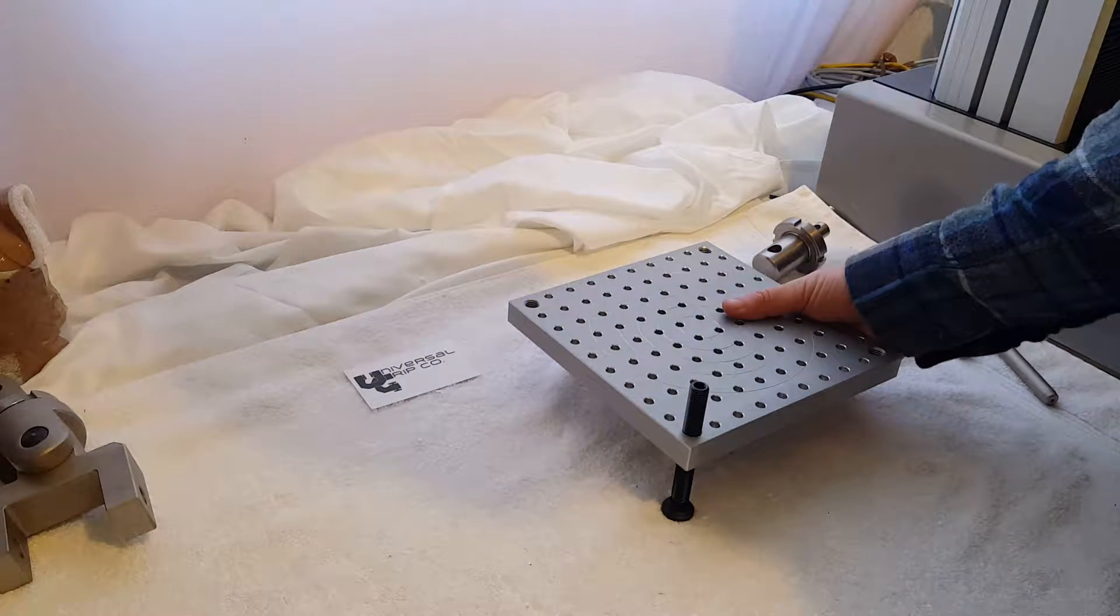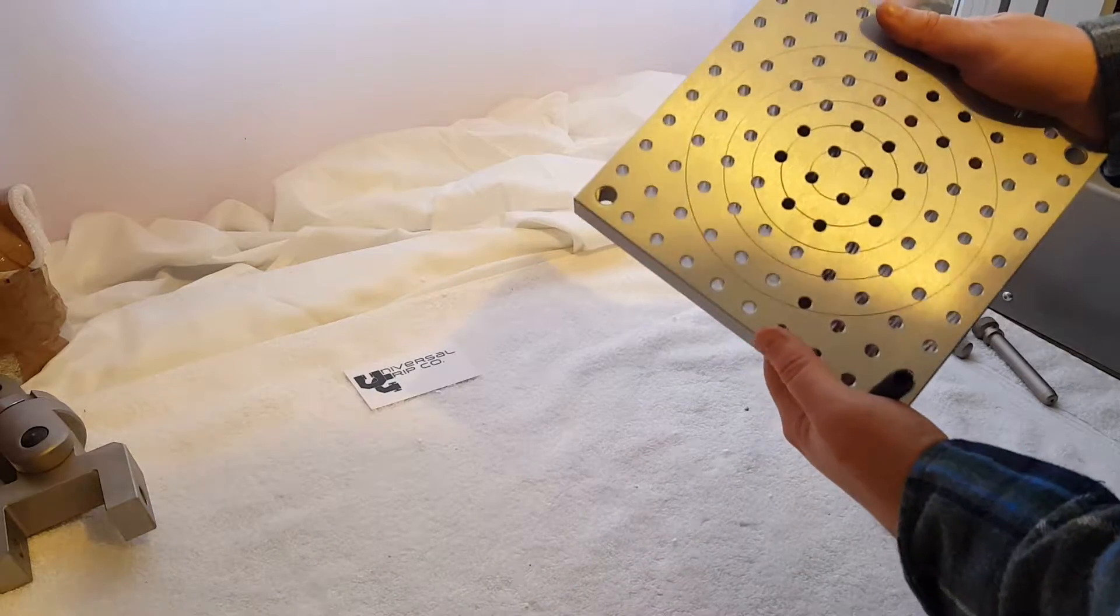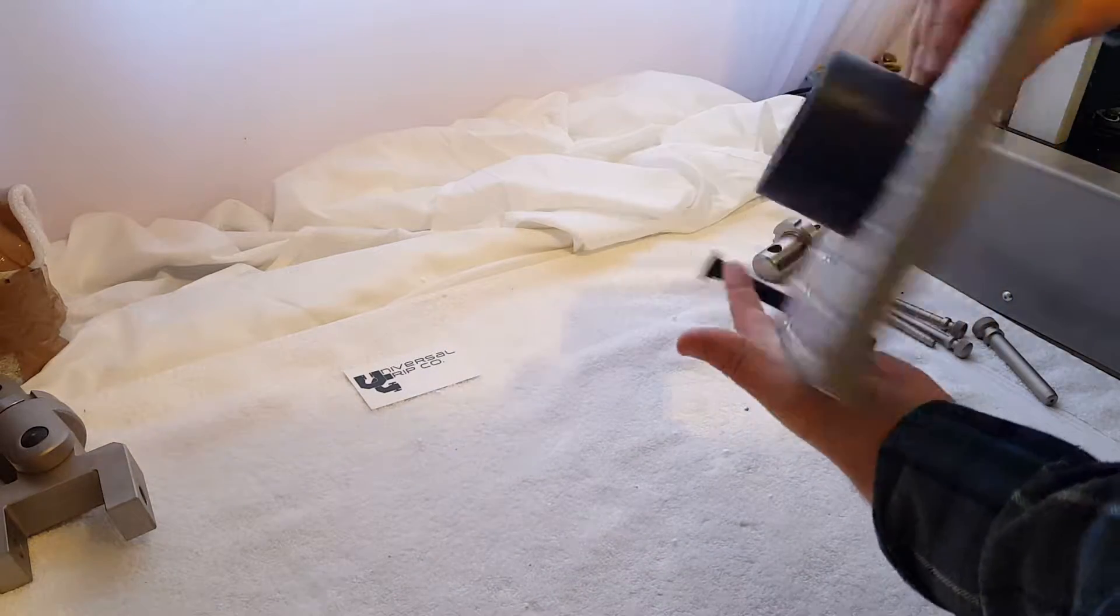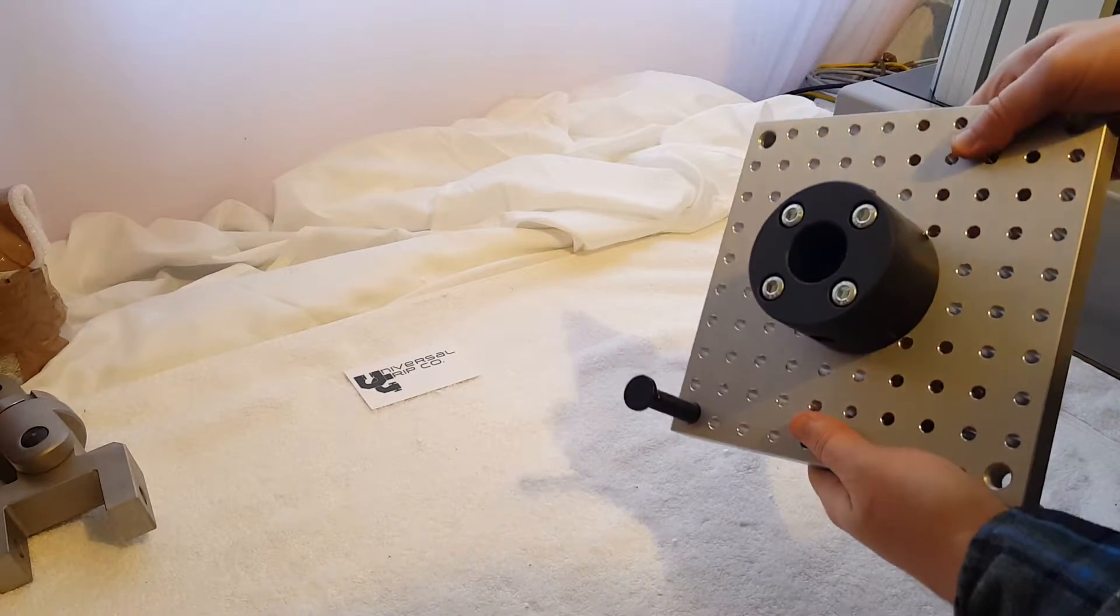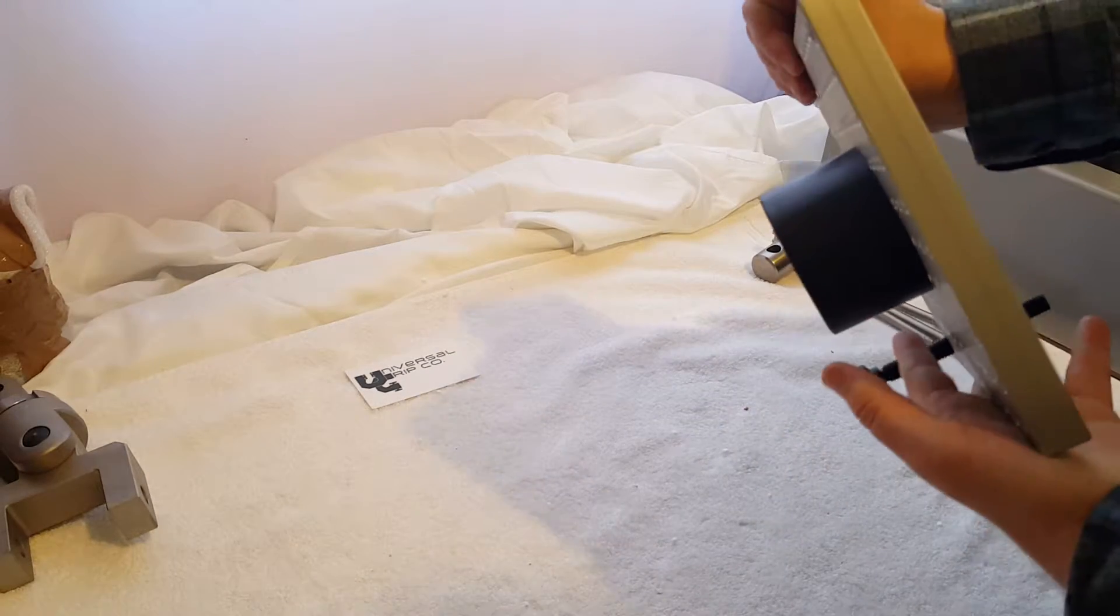This is for compressing any type of foam. Any type of polyurethane or polyolefin type of foam can be tested in compression.